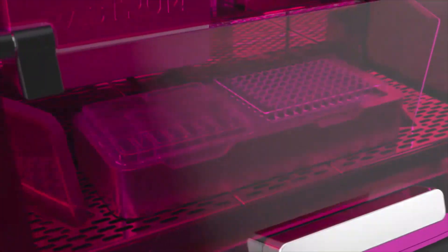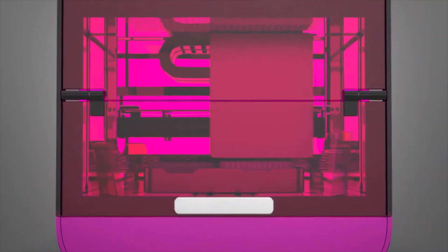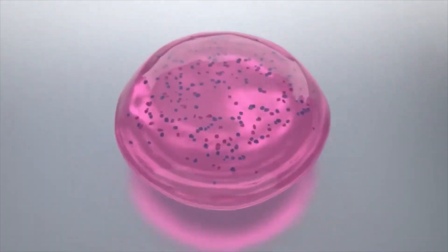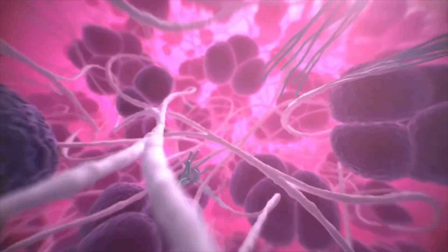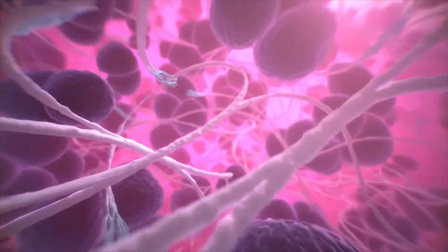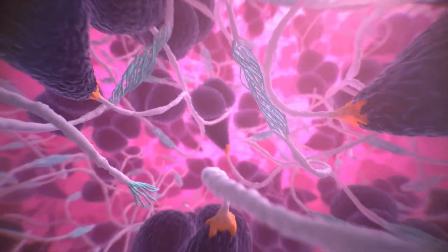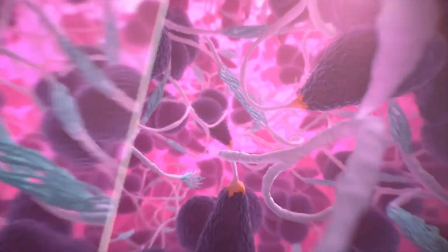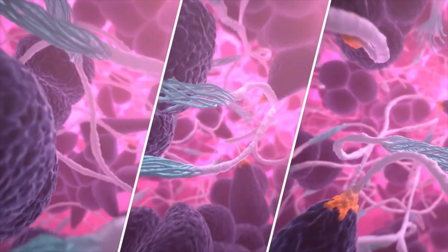Printing commences once the kit and multi-well plate are inserted. Droplets of cells and matrix components combine to form hydrogels instantly. The hydrogel matrix is carefully engineered with a tissue-matched stiffness and rich bio-functionality to support each cell type, presenting a consistent environment batch to batch.